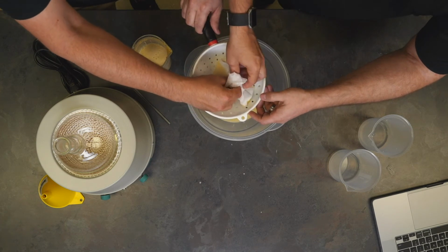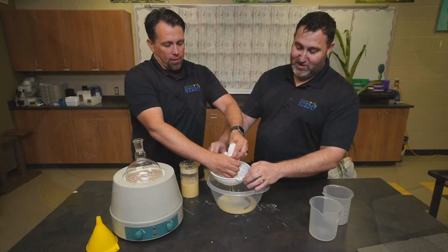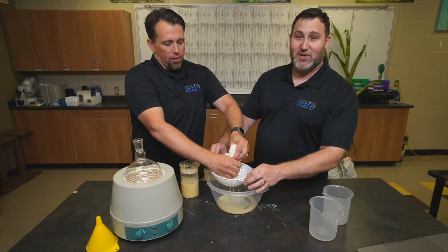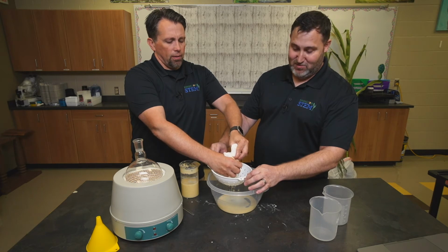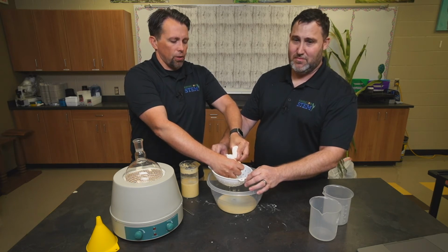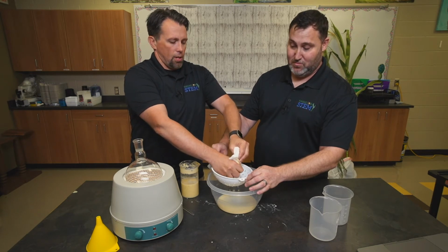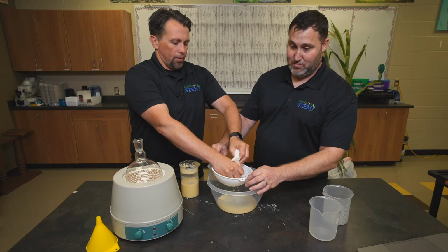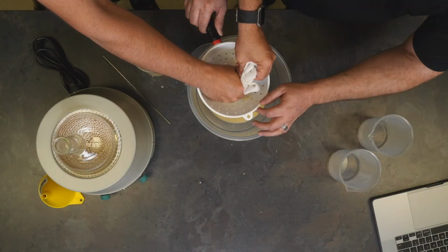As we mentioned earlier, there's a lot of ethanol in the solids, so you just kind of got to reach in and squeeze out as much of our liquid as we can. And you'll get some solids through. It's not a big deal. You don't want enough solids to be sitting on the bottom that it's going to scorch and make cleanup a problem. I've distilled with the solids in, and it doesn't hurt anything, just makes cleanup a mess.